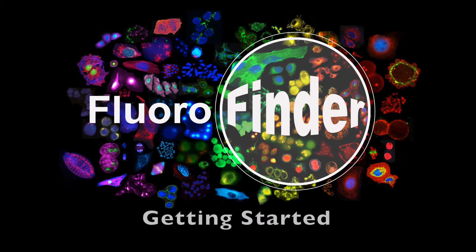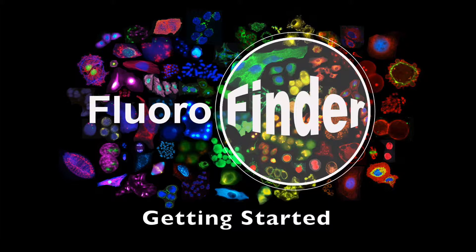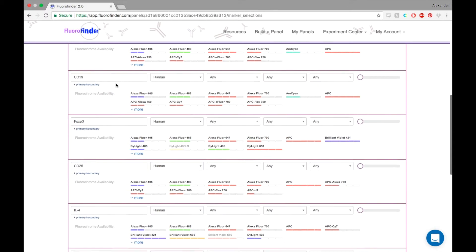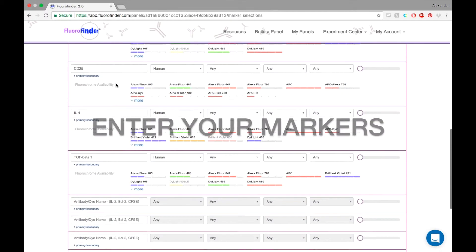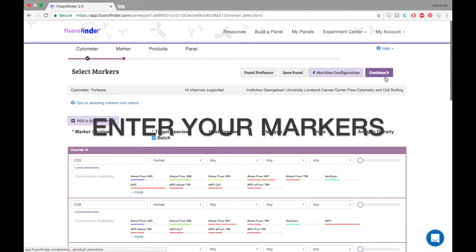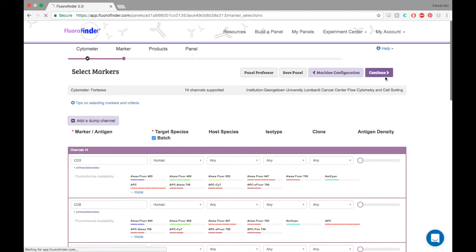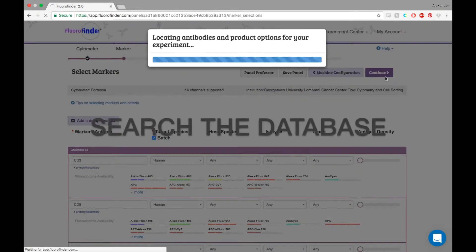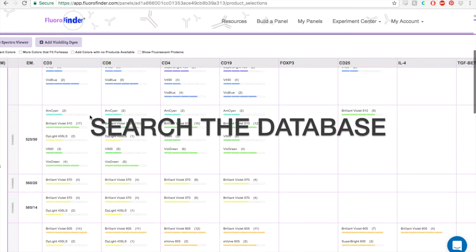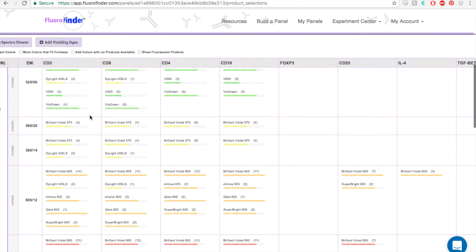Fluorofinder is an online tool that lets you quickly and effectively design multi-color flow cytometry experiments. Our software takes your desired list of markers, runs it against our database of over 250,000 products, and then pairs the results with your specific machine configurations.